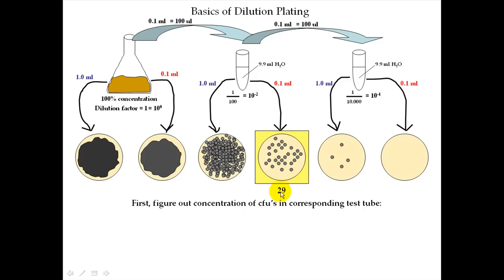So you can use this number to figure out the concentration of CFU in this sample by actually just looking at it. All right? You can see that when you took 1/10 of a mil out of this sample, that 1/10 of a milliliter contained 29 CFU. So that's the concentration then in this sample. There are 29 CFU per 1/10 of a mil in this particular sample.